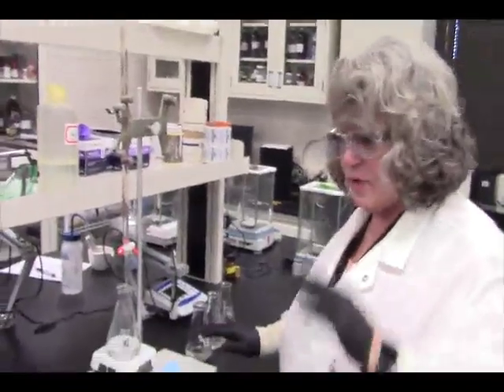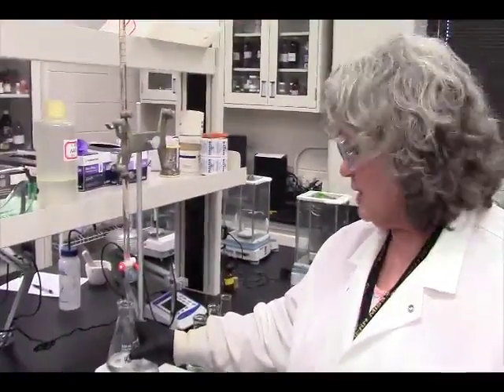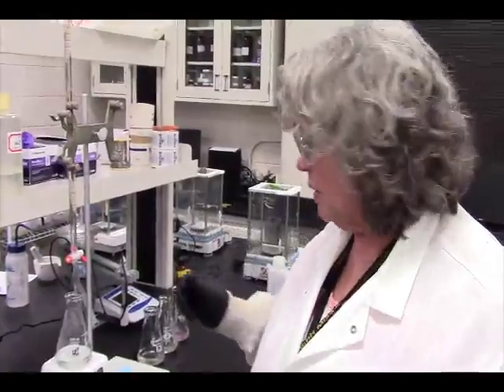We have already done 3 of our samples. This is our last sample. So I wanted you to see this titration. This is just an acid-base titration, so there's nothing that's unusual about it.